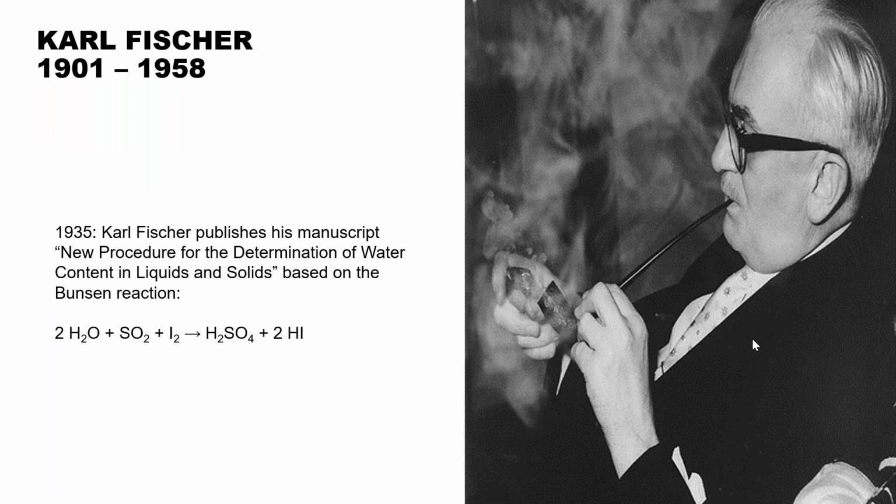So Karl Fischer titration. What is Karl Fischer titration? It is a water content determination method that is named after its discoverer, Karl Fischer himself, shown over here on the right-hand side of this slide. Karl Fischer was a petrochemist working in the early 1900s, and he was tasked with searching for a method to determine the water content actually in sulfur dioxide. As he was trying to figure out a way to do this, he remembered the Bunsen reaction shown on the screen, which is between iodine and sulfur dioxide in an aqueous medium.